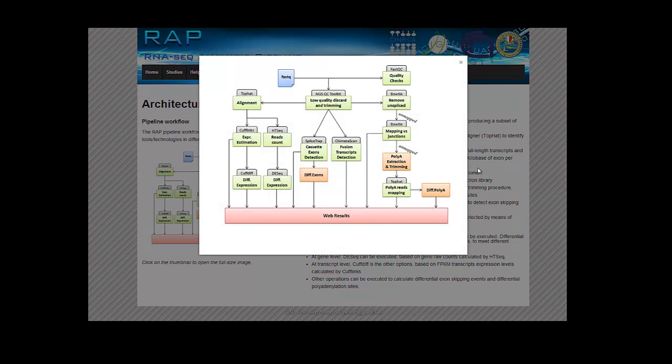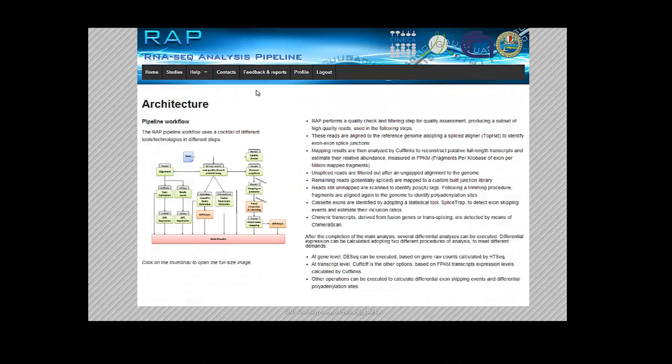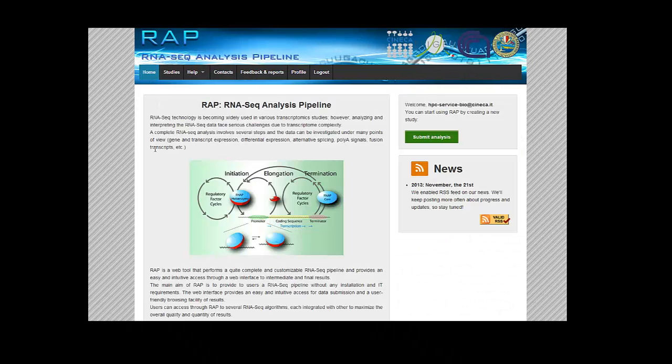All the analysis jobs are submitted from the web interface to a high-performance computing cluster, and this process happens in the background so the user can monitor every analysis step from the application. Once the analysis is over, results can be visualized through the web interface or downloaded for further use. But now let's peek inside the application.